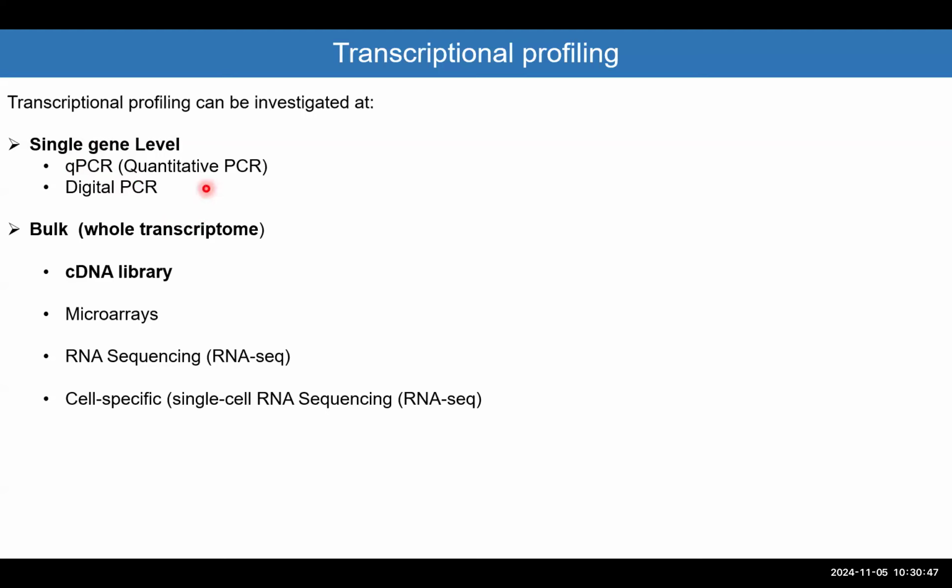There are multiple types of PCRs. One of them is digital PCR, which we rarely use, or you have at least to be very good in doing qPCR in order to be able to do a digital PCR.